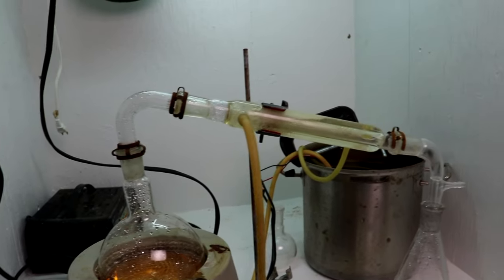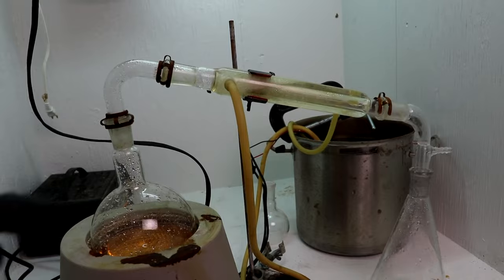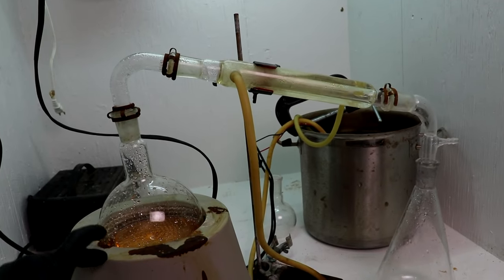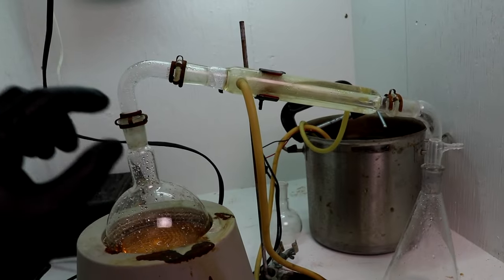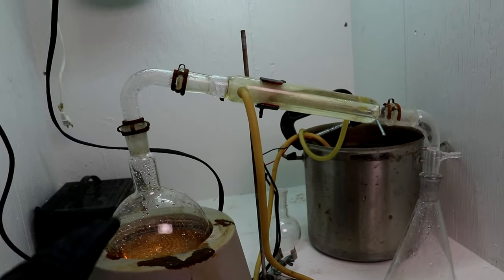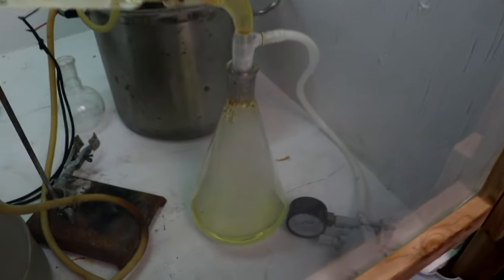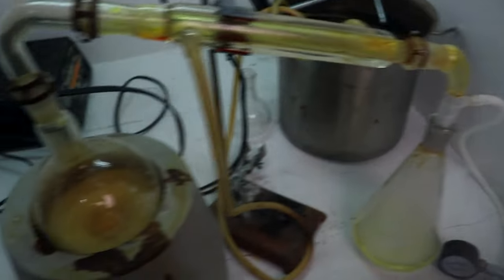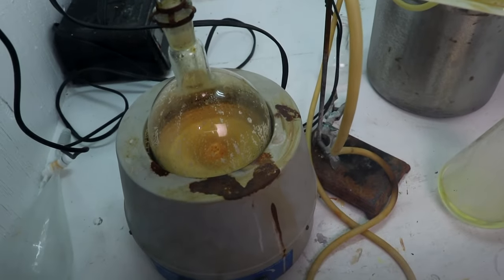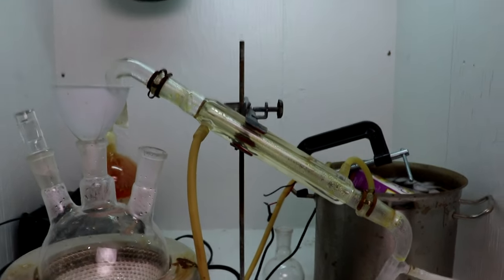Okay, so here we are. I've got it set up for a simple distillation. A fractional distillation column would achieve a higher purity, but I'm okay if I'm getting a dilute acid. I just want to get an acid that doesn't have all the sodium and stuff in it. Okay, looks like it's done. I've got some hydrobromic acid, and the leftover sodium sulfate.